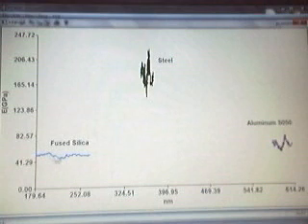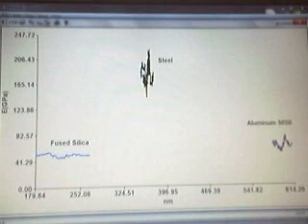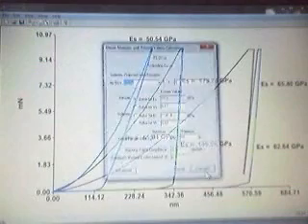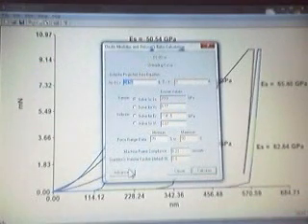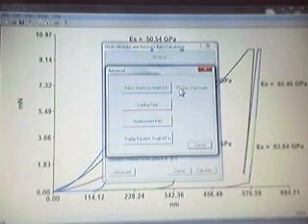As you can see though, they're spread out along different depths. We could also plot these using the same zero. To do that, start the graph over. Click on it. Click on Advanced. And then before you make the graph, click on Zero Start Depth.